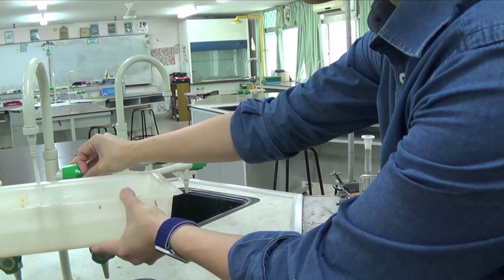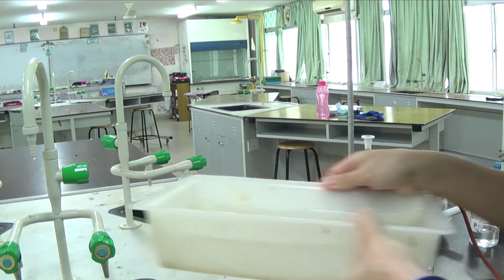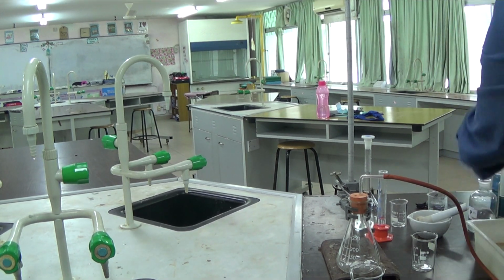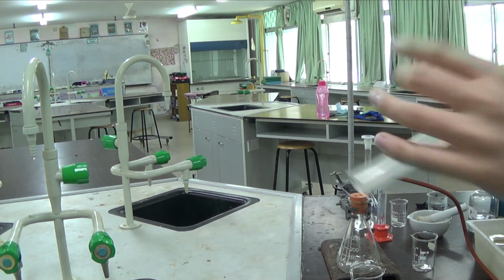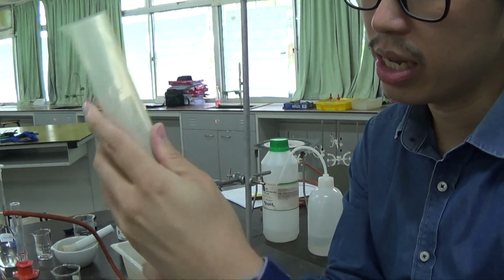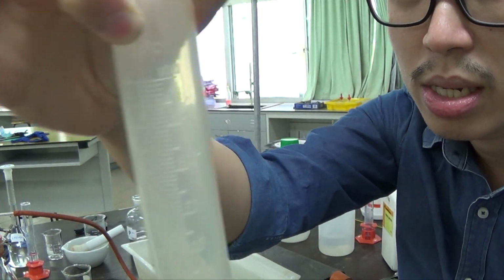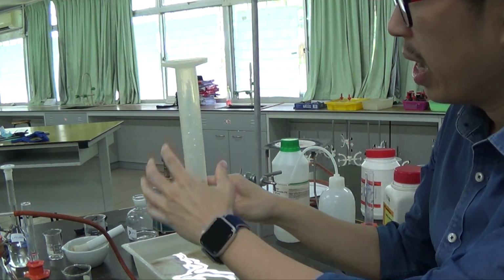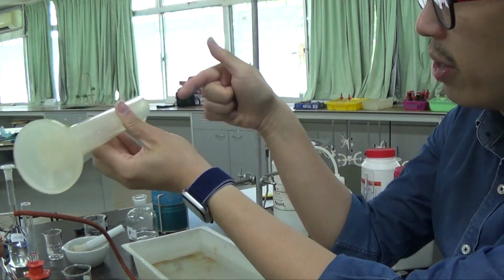So this is collection of gas. Make sure you know this technique. It's a very important technique here. What I have here is a measuring cylinder. This is another measuring cylinder, a bigger one. It measures from 0 all the way to 100 milliliters, which is 100 cm cubed. We're going to invert this, but at the moment there is no water inside. There is just air that fills up the inside.